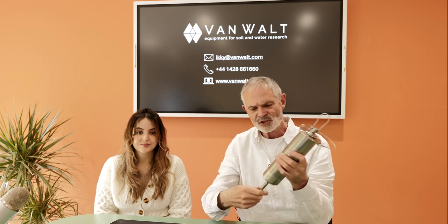seabed, and it's an important layer because this is where you may be particularly interested in when you're doing studies such as anti-fouling residues in harbours, or indeed you may want to measure water in lakes to see what is close to the sediment at the base of that particular lake. I'll just open the device so that you can see what it looks like inside, and it's important that this is done also to clean it.